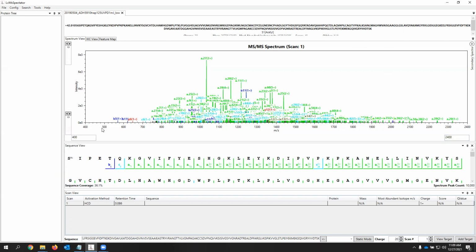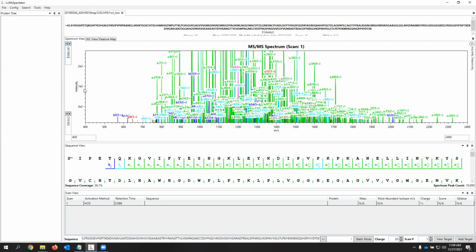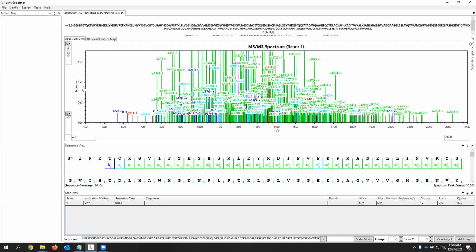And if you have the manual adjustment checked, it will also give you the window where you can type in the numbers you want to zoom in on. Say if I want to highlight the smaller ions, like this, you will zoom in to the smaller ions, and you can better display them this way. The same thing works if you use your middle mouse button to scroll, and you will be able to zoom in as you wish. And if you right-click and drag, you will be able to pan through the views. So this is the same as your LCMS data.